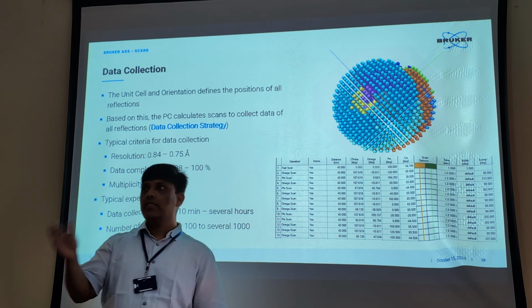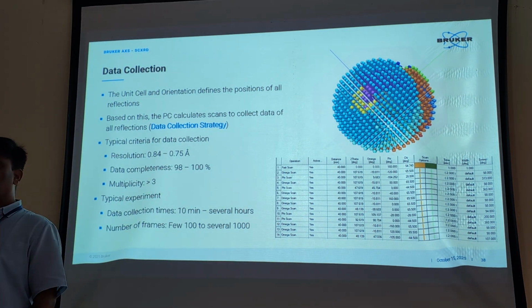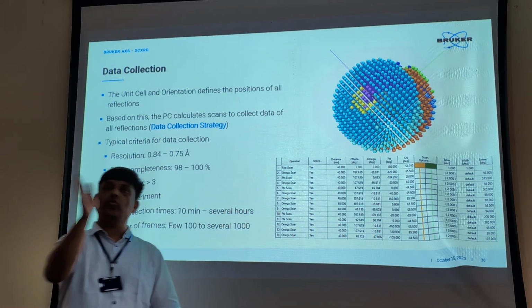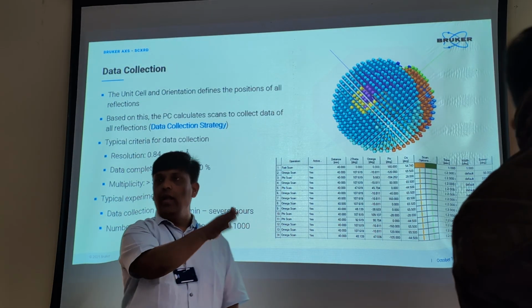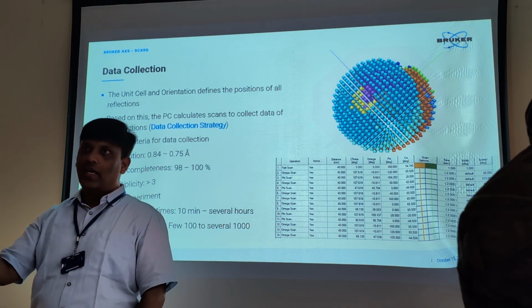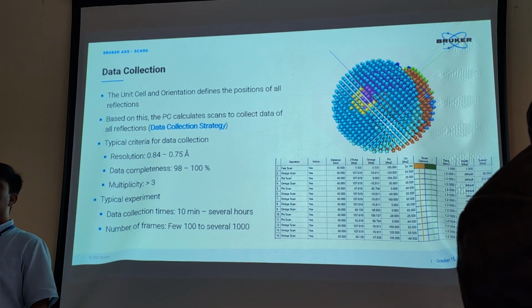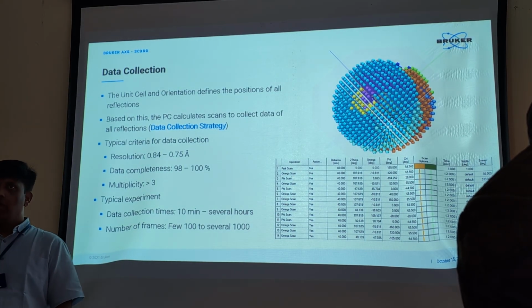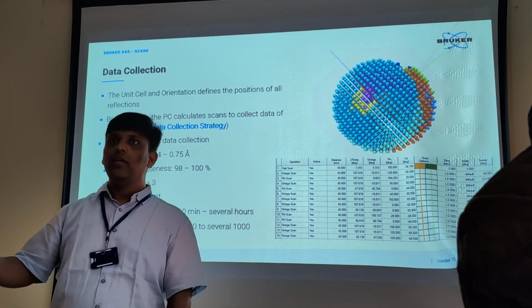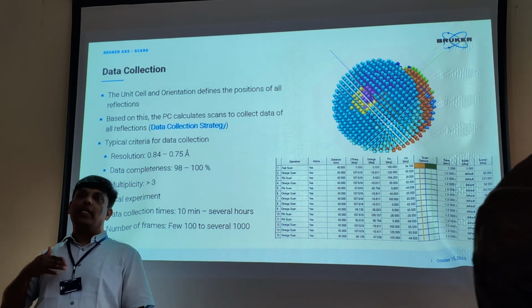Okay. What is CIF? Crystallographic Information File. That is independent per structure, and that structure has to go through this checkCIF report, and then it should not have alert level A, which is a serious problem, alert level B, which is close to a serious problem, alert level C, which is check and modify or clean, and then alert level G. So it should not have A and B at all.